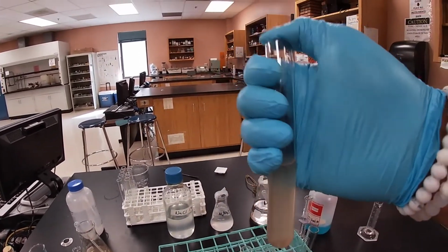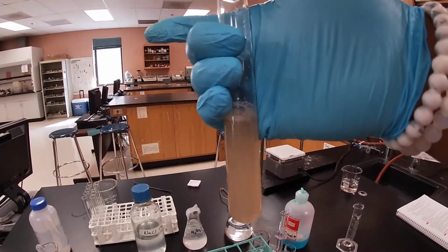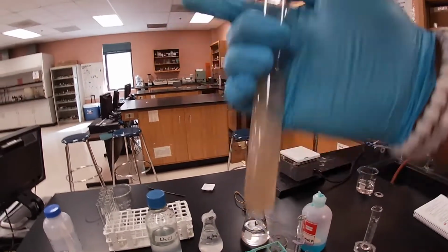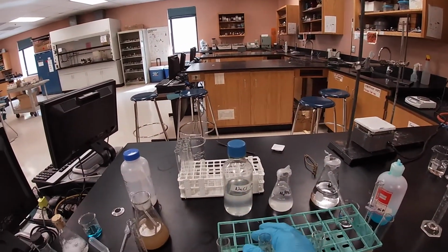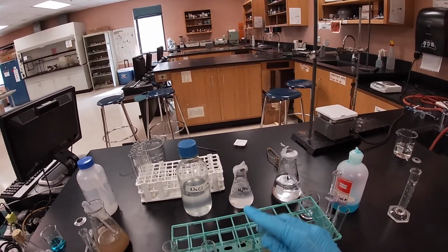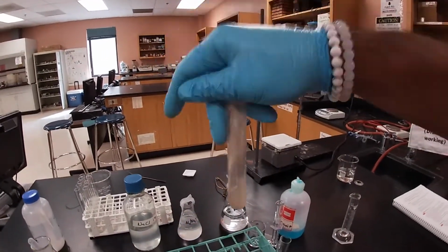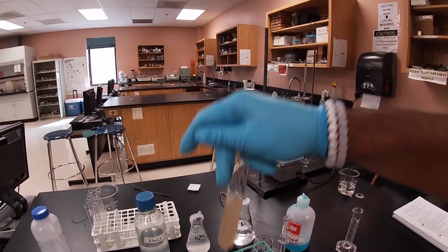This one's gonna be the sodium chloride one. And then we're gonna let them sit for, what did we say? For 15 minutes. So here we got that part.